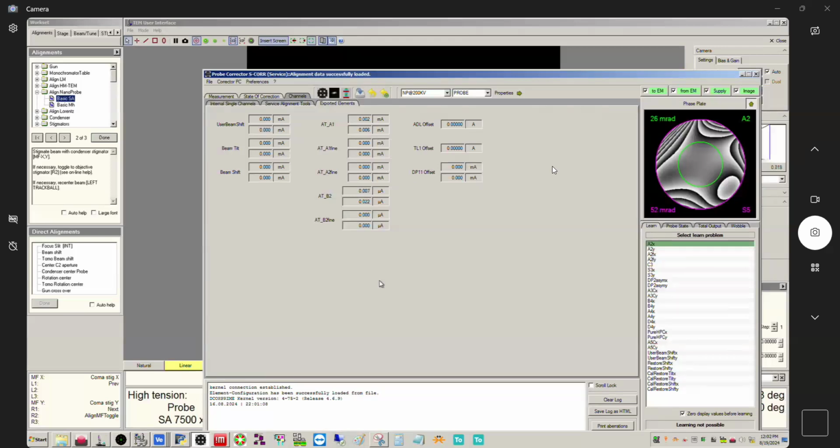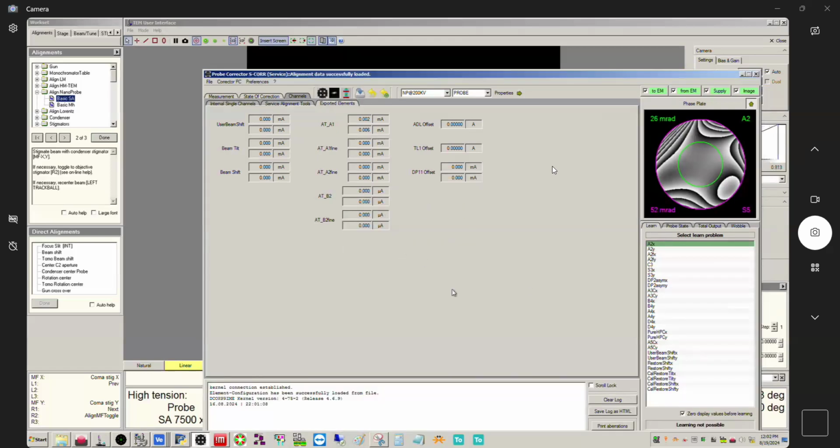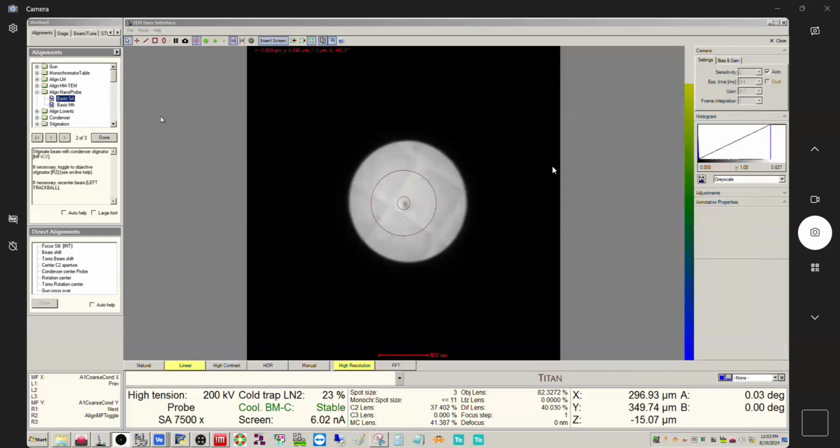See if we can get this to be zeroed. Reset. Okay, it did it. Oh, that actually worked. Okay. Now, why is ATA1 still there? We switch that, reset it, that goes to 0 as well. Okay, perfect. So all of our exported elements are zeroed out now. Good. Okay. So we're fine there.